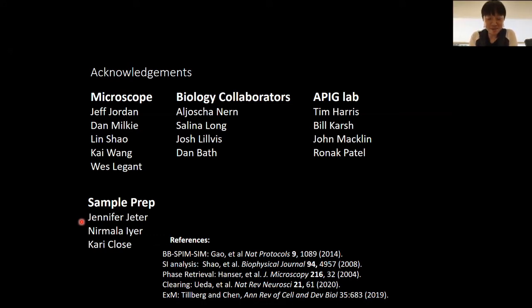Yeah, I share the interest with Steve and Yurika. The phase retrieval sounds very amazing. From the perspective of users, people use microscopes, so is there any way to have a standalone phase retrieval tool to calculate the aberration? It's pretty simple code. I got the version that I used from Kai Wang, and I don't know if he ever put it up on GitHub. But it's a pretty simple calculation.